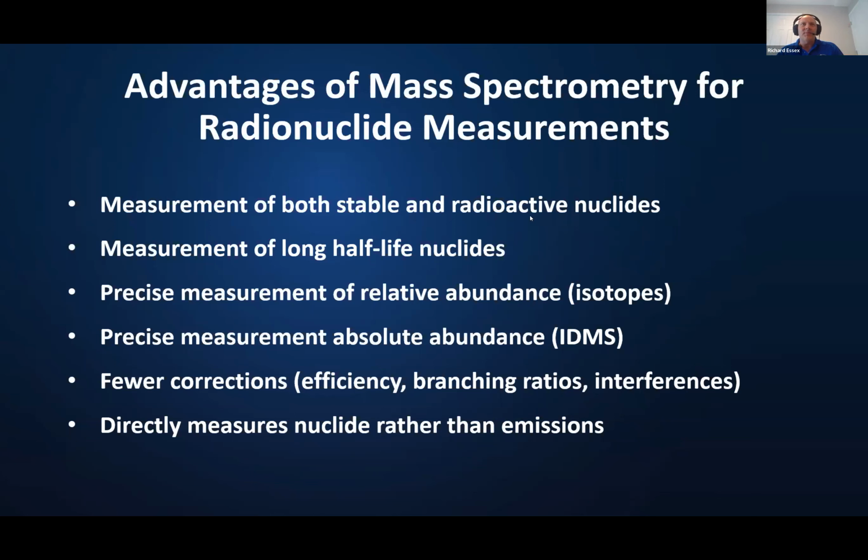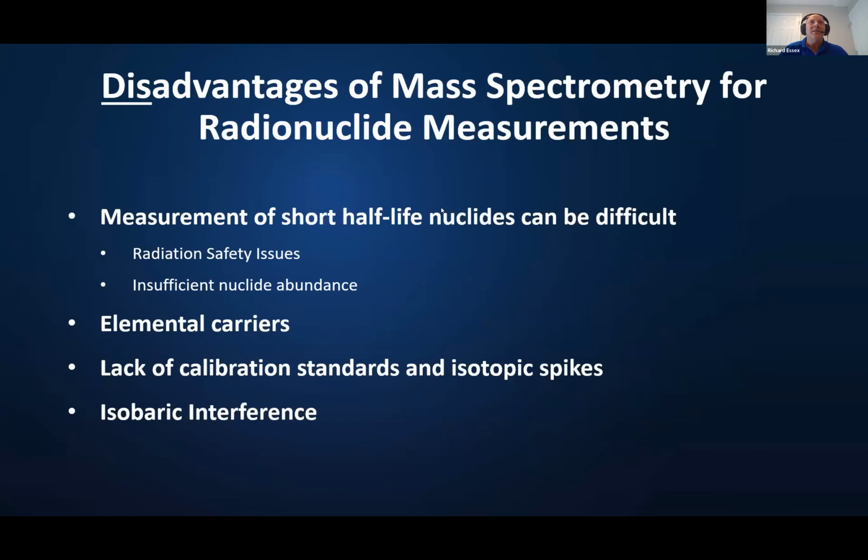One thing I also want to bring up is the flip side of this, and maybe other folks will want to touch on it: what are the places where mass spectrometry falls short, or maybe a better way to put it is, how can radionuclide metrology and classical counting methods help out with mass spectrometry, isotope ratio type measurements, or measurements of nuclear materials, for instance.